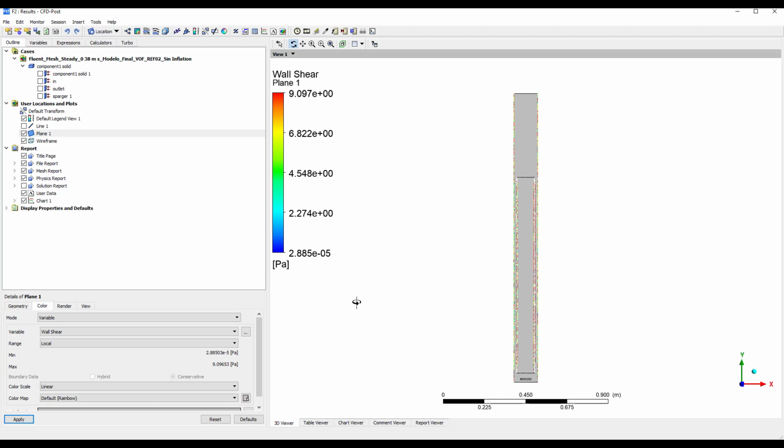In this example I showed in this video, I only did the simulation of the fluid. The next part, once you have your model validated, is that you can include the movement of the algae cells and see the trajectories and see how you can change the model, the dimensions, or which changes you can make in order to improve the behavior of the bioreactor, which, as I said before, is somehow related to how the cells move inside the bioreactor.